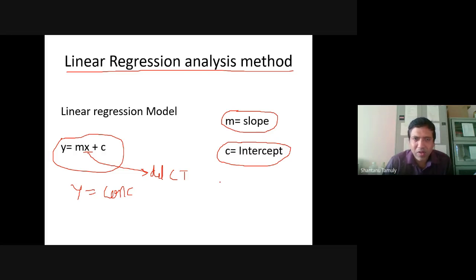Software will give you. This regression analysis involves a lot of formulas, this and that, but I don't go into those formulas because everything is done by software only. So I leave all these things to your statistics class. I will not discuss it.